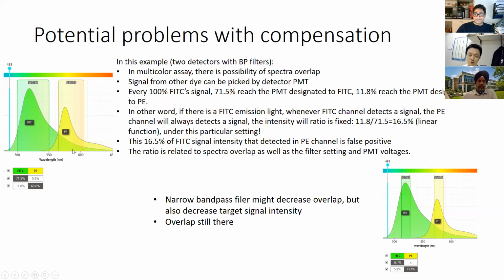That's the ratio for the purpose of compensation. Today we are not paying too much attention to compensation because that's another topic. If you are really interested, or you get really confused on these slides, we can find another time and give you another seminar focused only on how compensation works.